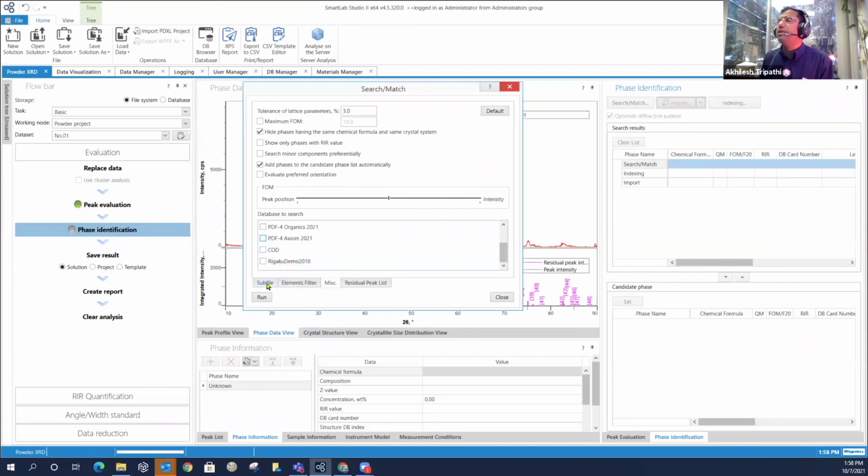It has not been divided into subfiles. Also ICSD, the Inorganic Crystal Structure Database, a FIZ-NIST product, is also not divided into ceramics. Later on, I might show a little bit more of this software's features, but at this point, just answering this question.